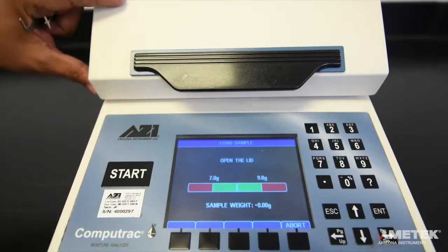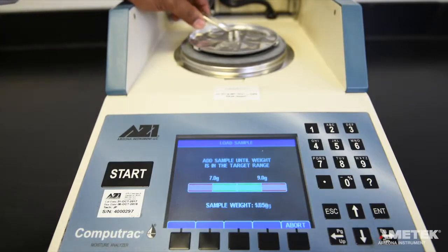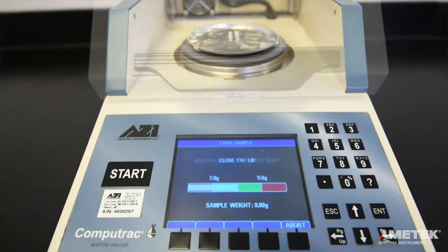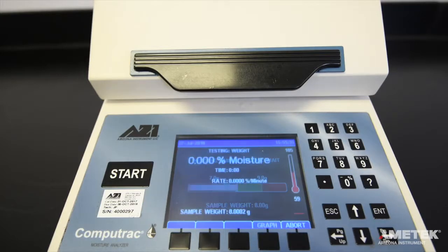Open the lid and use the tweezers to carefully place both the three and five gram weights in the center of the pan. After you have added both weights and the total weight registers within the green part of the graph, follow the on-screen instructions and close the lid. The instrument will then determine the initial weight of the sample and then start the test and return to the main screen.